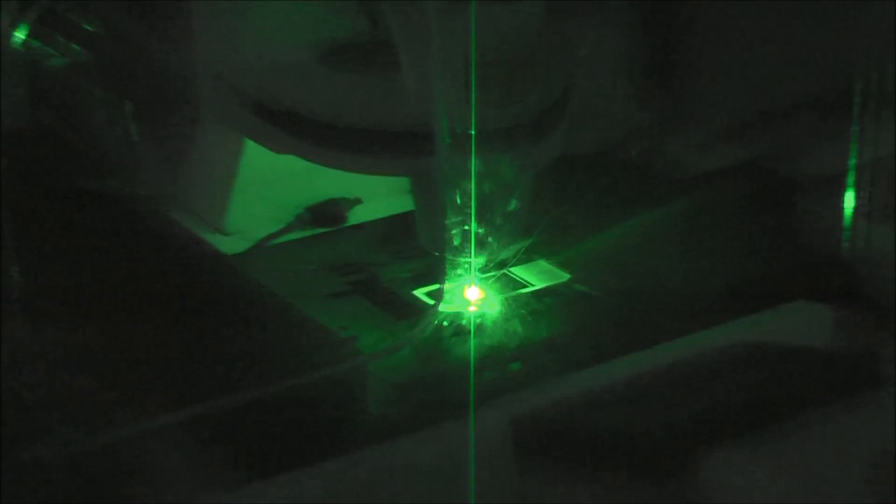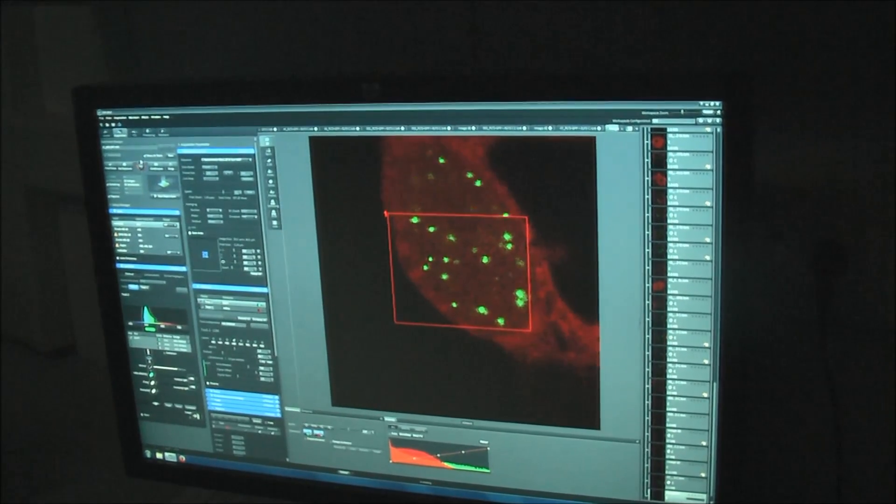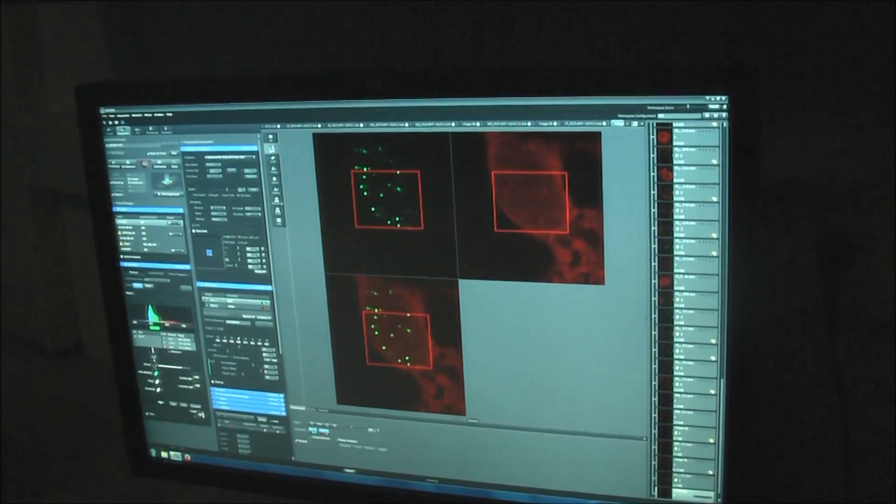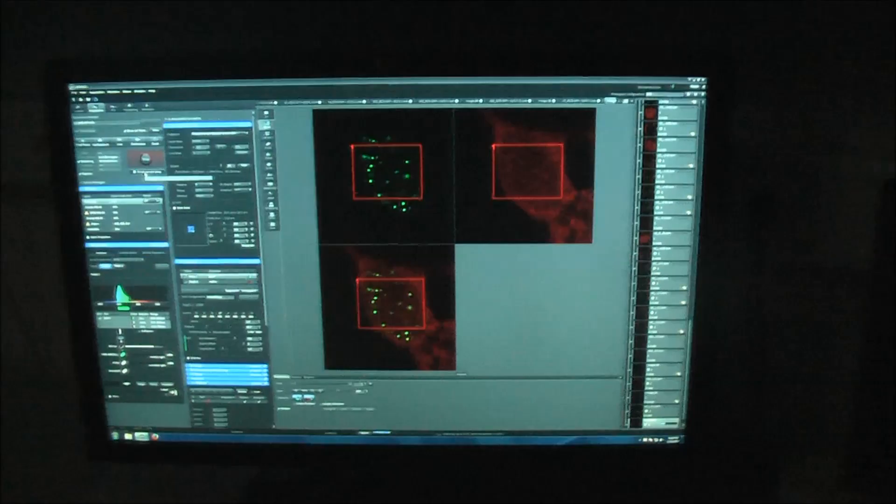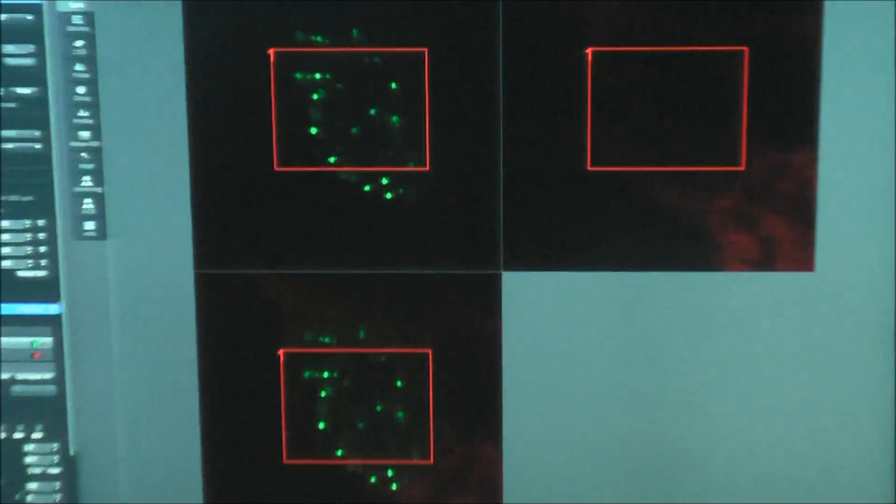Here a laser produces light with a specific wavelength and the microscope detects the fluorescence of the sample. In the leaf cells the GFP fluoresces and shows the localization of our protein of interest. We can even see how the protein moves inside the cell.